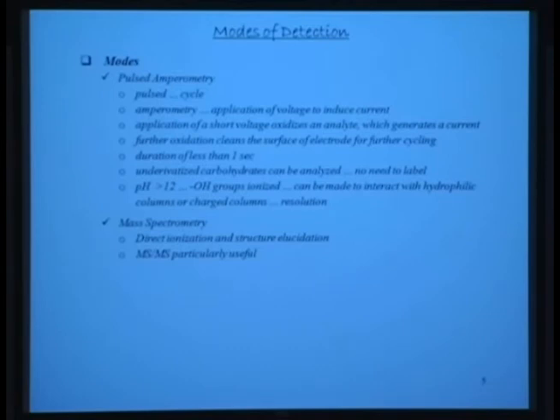It doesn't say which particular carbohydrate. Obviously, you can use the retention time to identify what carbohydrate or glycan is actually coming out, but it simply generates a current. Some of the carbohydrate would stick to the electrode, and over a period of time, if you don't clean it appropriately, the signal would deteriorate and you would see basically no signal. So in every cycle you apply a high potential so that you further oxidize and clean the surface.